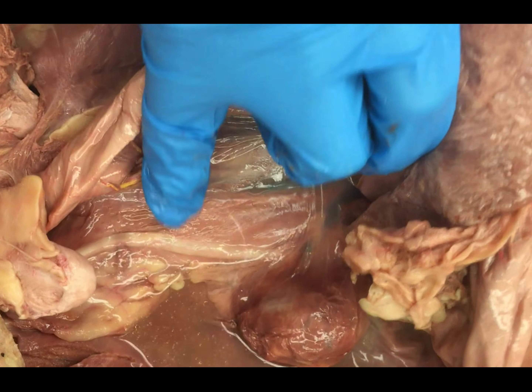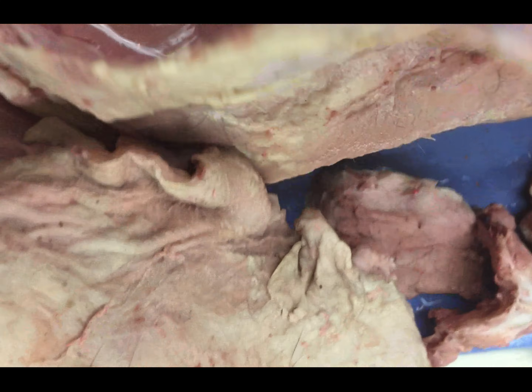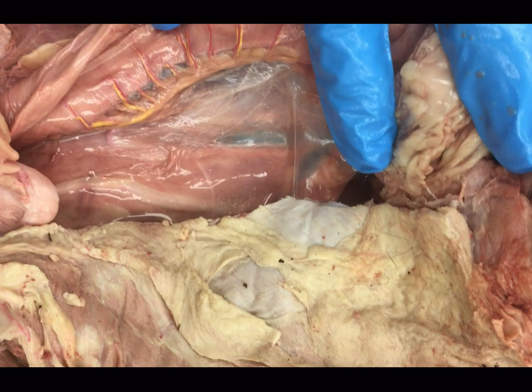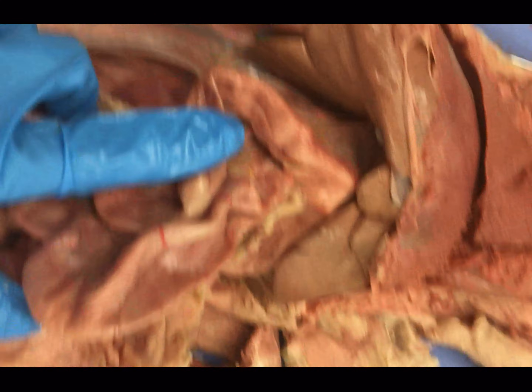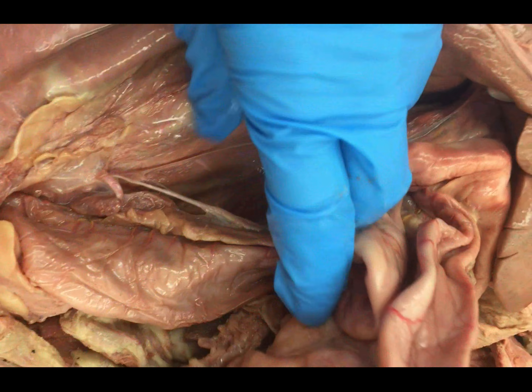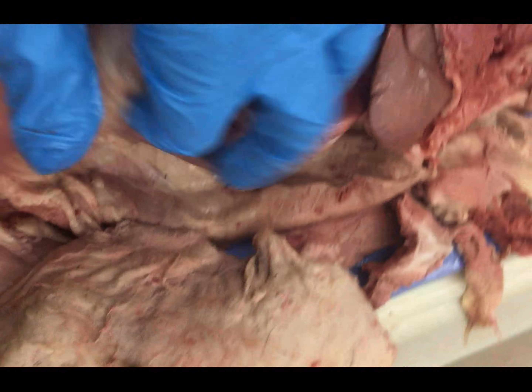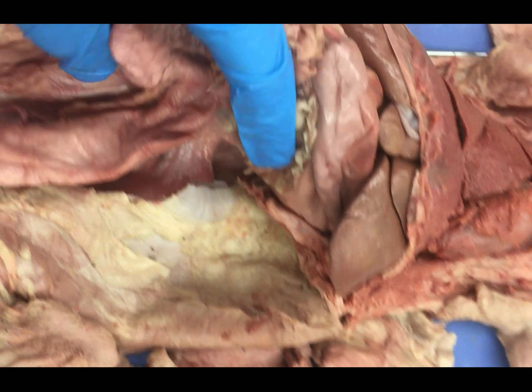Here we can see some of our major vessels like the vena cava, and you can find our ureter here as well. It's going to be a lot of pulling back. You're going to want to reflect to the cat's right side — if you reflect the organs to the right, it will be a lot easier to identify than if you reflect from the left. However, there are going to be vessels we want to see and some cat's organs are going to be a little bit easier to manipulate in certain directions than others. So if you're having trouble identifying vessels from one side, flip the organs over and check them out on the other side. And that concludes our blood vessels.